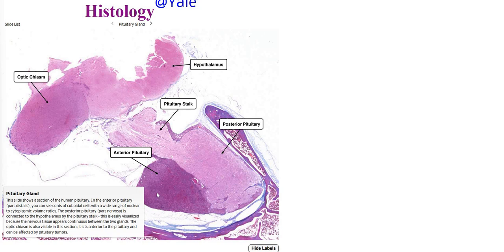The anterior part is also highly vascularized. If we zoomed in here, we would see tons and tons of capillaries that typically stain darker on a slide. That explains why the anterior pituitary is much darker in color. It's almost purple, versus this continuous material here, which is a little lighter pink. And we would expect this to all be neural tissue, the hypothalamus and that posterior pituitary gland.